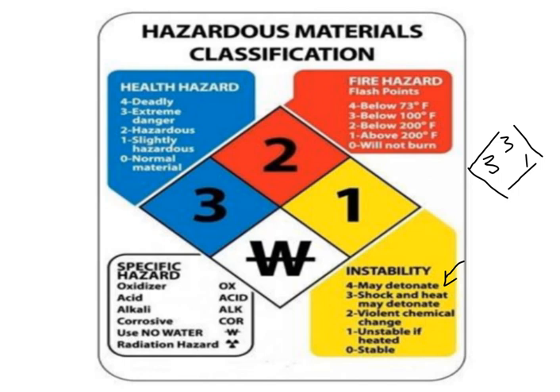So let's do a quick recap, and then I'm actually going to give you guys a little bit of free time to work on whatever you want. But let's do a quick recap of the day. We need to know safety stuff. Really, there's 4 main safety things you guys need to know. I think 4 we can break it up into.